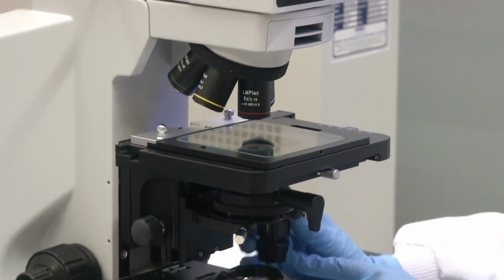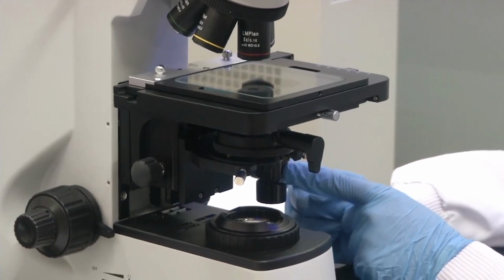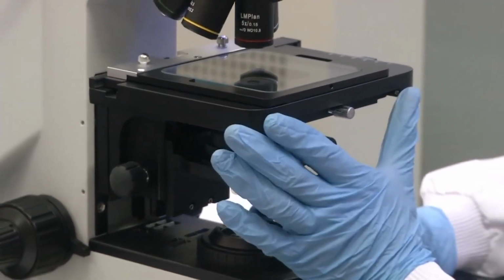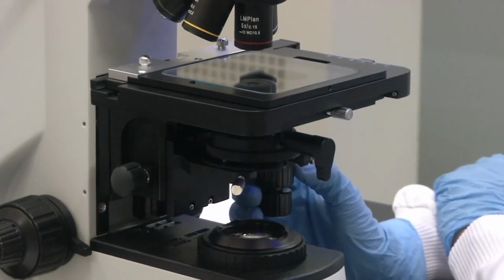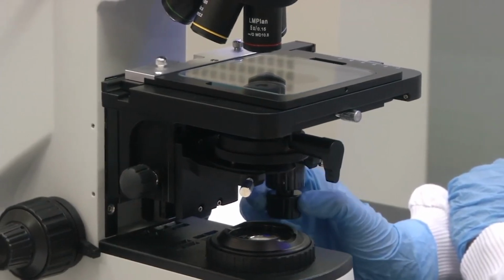Just below the sample holder there is a knob where my blue gloves are. I think you can see it. This knob is used for XY movement of your stage. The sample holder in a metallurgical microscope is called a stage. If you adjust the knobs here, you can move the stage. I think you will be able to see the stage moving.